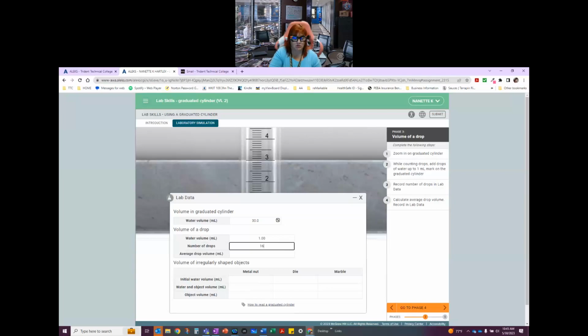And if I do 1.00 divided by 16, I end up with 0.0625. And if I enter that number, it's perfectly happy. Now, I don't think that that's a reasonable number. Okay. Well, I mean, personally, I would think that we would only be able to go 2 decimal places past, and so that's stretching things a little bit to do it that way.